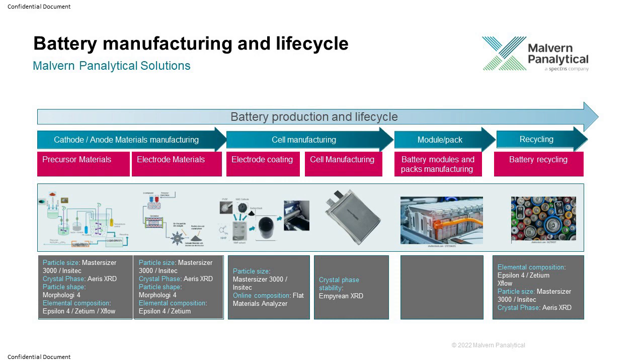Okay, now coming to our solutions. Starting from the precursor materials, because usually when you synthesize these materials, you don't directly synthesize the final cathode material. You start with some precursor material. For example, if it is NMC chemistry, then the precursor material will be NMC hydroxide, so the hydroxide of nickel, cobalt, and manganese, which is then synthesized from the pure sulfates: nickel sulfate, cobalt sulfate, and manganese sulfate.